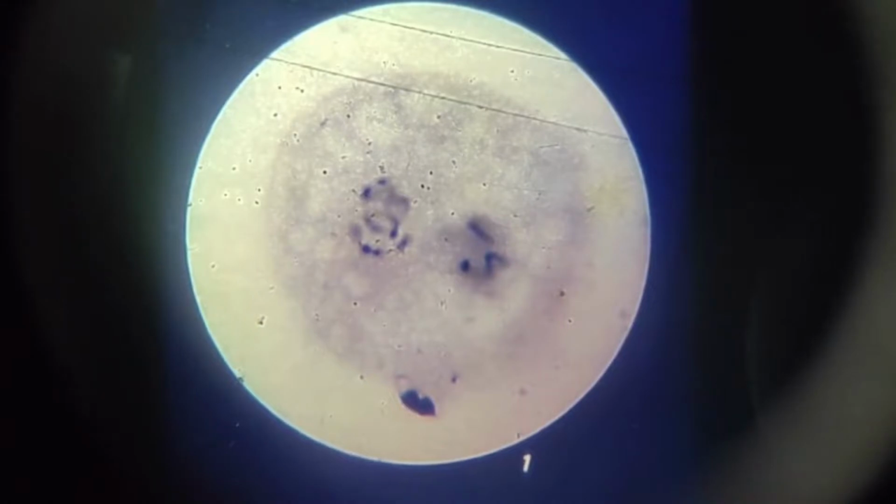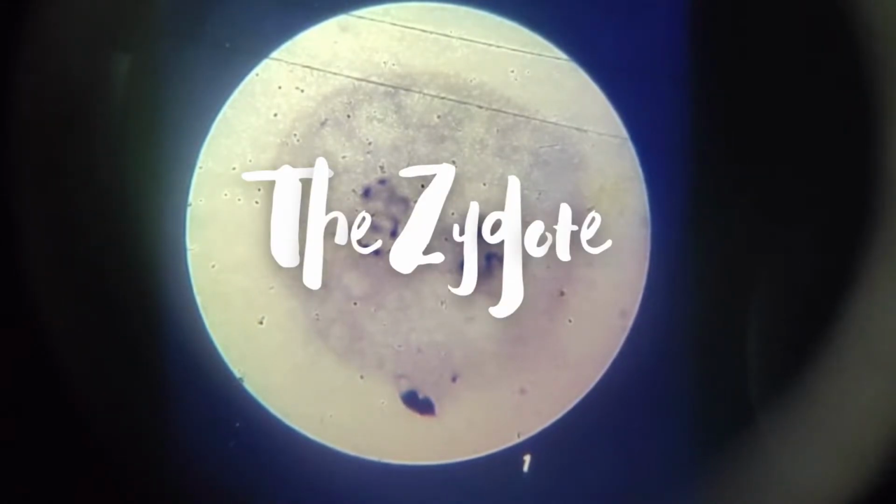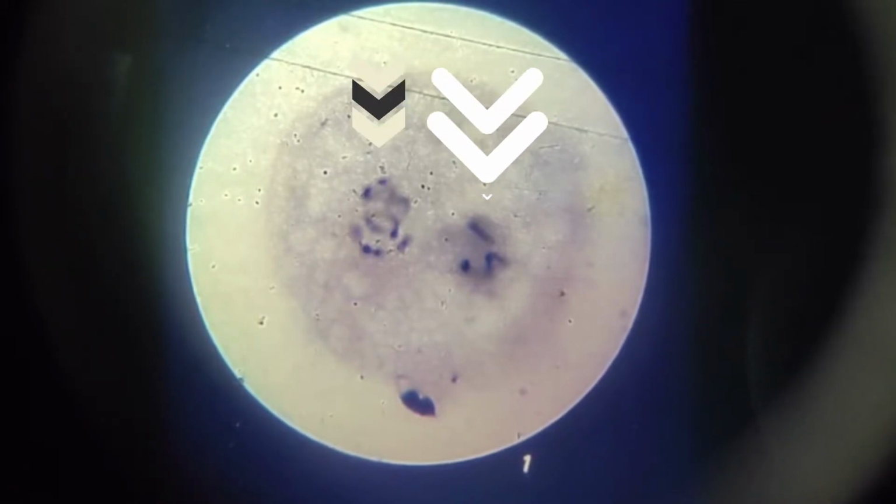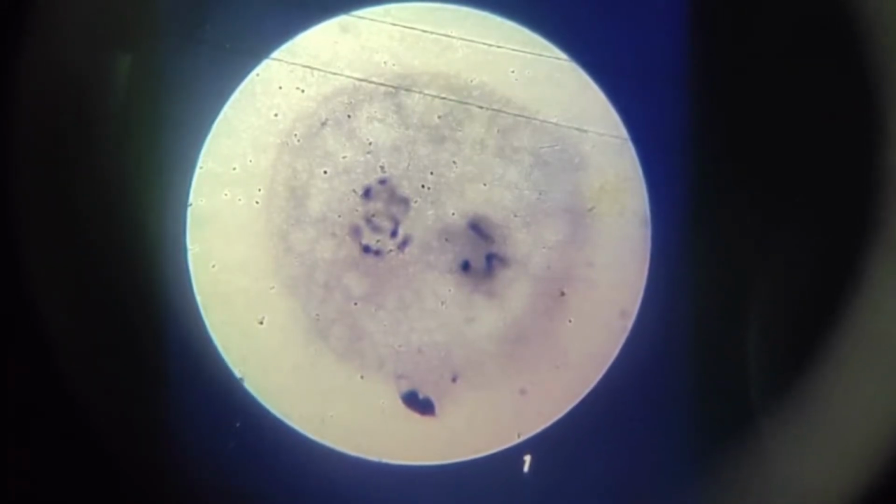This slide shows the zygote, the fertilized egg of the Ascaris. Two masses of chromatin can be seen in the cell. One mass was the nucleus of the egg. The other came from the sperm that fertilized the egg. The sperm and the egg are very different in size and shape, but the chromatin contributed by each is equal in amount. Each parent, therefore, supplies an equal amount of hereditary material to the offspring.